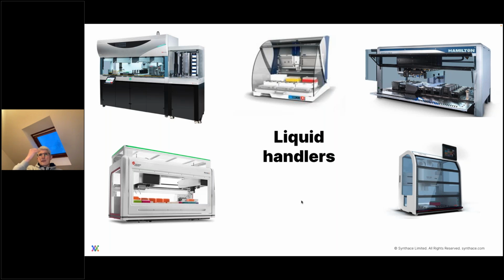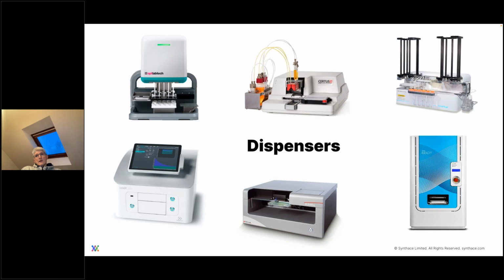And again, if we think about a complex experiment where we might have 300 runs and 20 factors, then that will be 300 times 20, 6,000 different liquid handling transfers. And if you're changing your tip every single time, that's 6,000 tips. And it's also a huge amount of time. You either need to think about ways that you can work around that, or you're limited to a maybe less complex type of design.